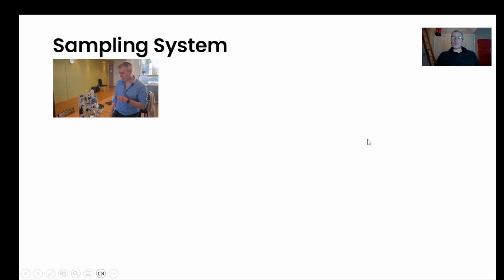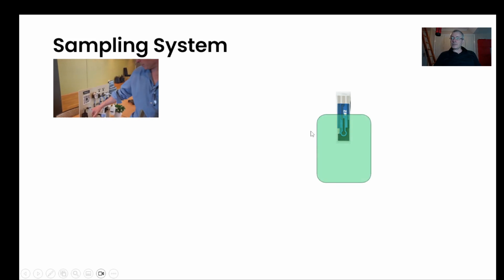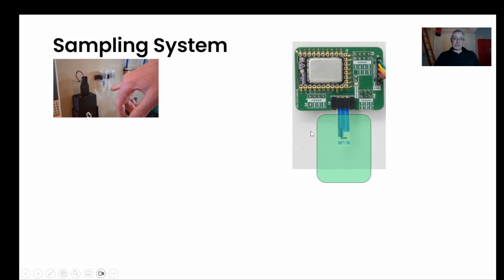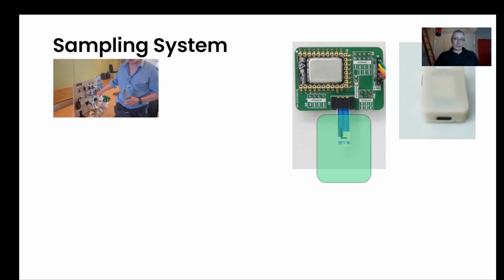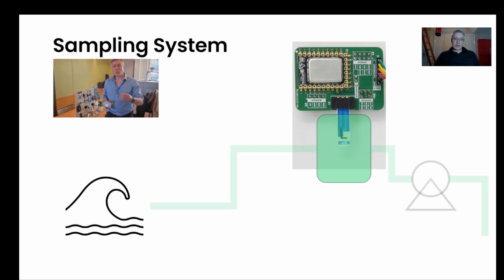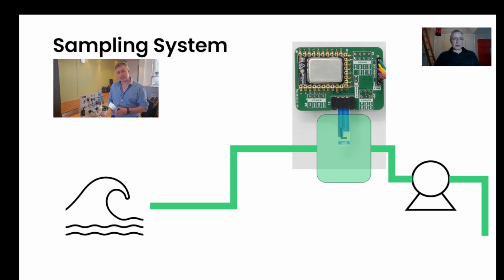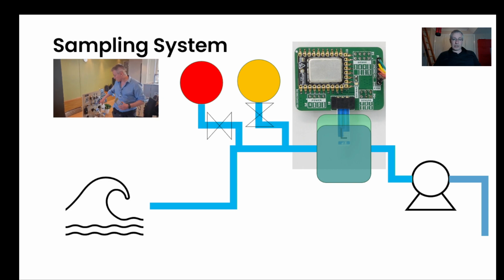But I'd just say that it really would require ZP to be part of a program in order to make that kind of technology really work, because the sensor needs to be in a kind of flow cell, it needs to work with ZP electronics, which we can house accordingly. So we can do it, but this is not an off-the-shelf product. This is a project, I would say. And then obviously we need to talk about what kind of sample size we need, what kind of pumping we need in order to get those samples onto that sensor. And then, does that sensor need washing? Does it need calibration? So therefore, does it need reservoirs?